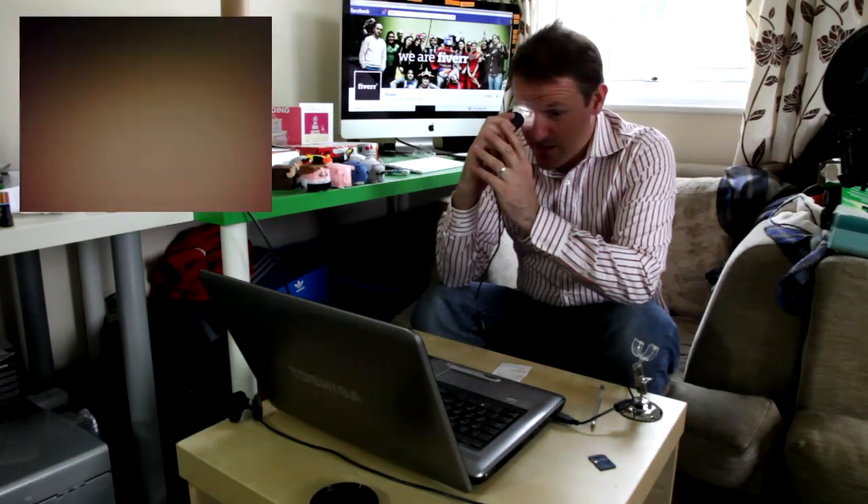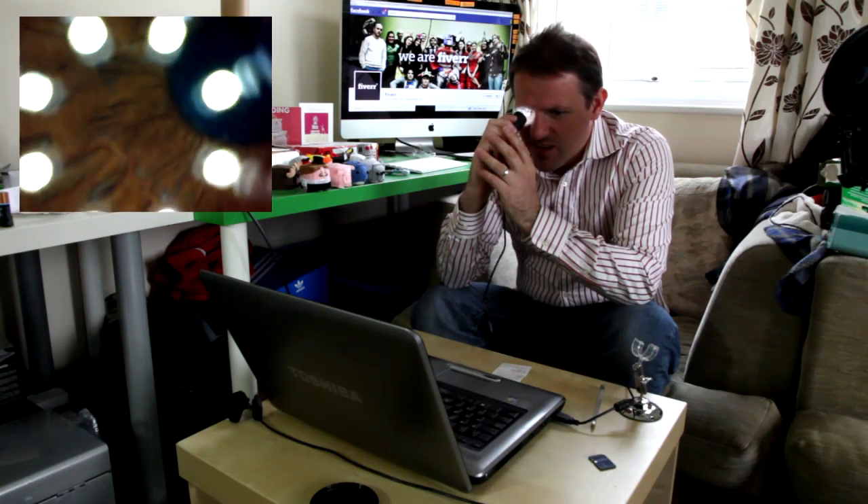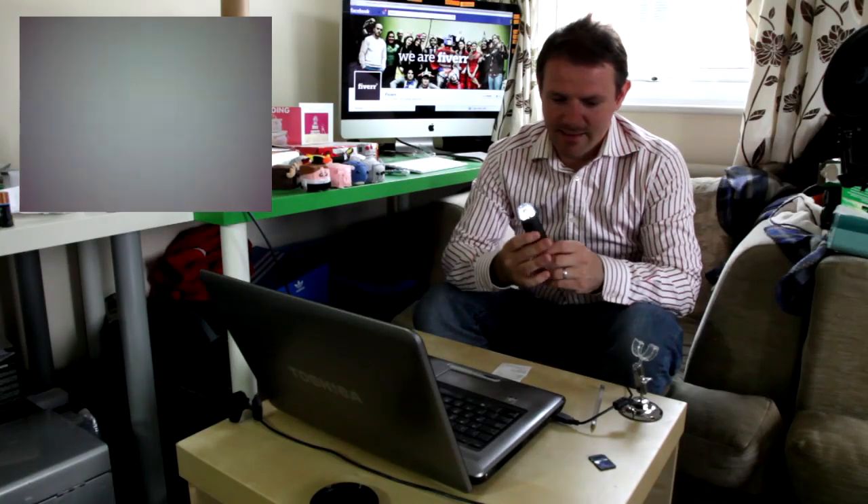Now showing my eye — is that weird or what? You can see the reflection of the light. Okay, that's the end this time, I promise.